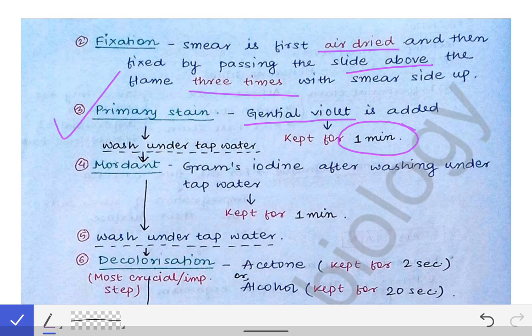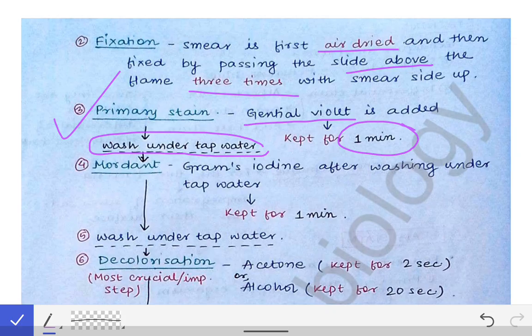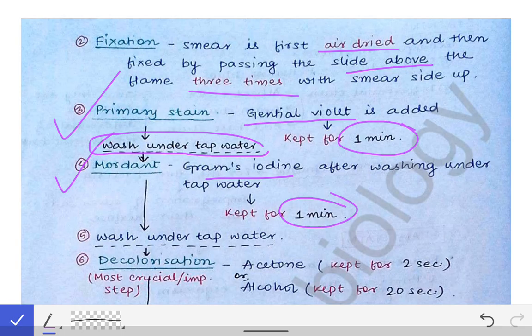Intermittent washing at each step is very important. After waiting one minute with the primary stain, we wash the slide under tap water. Then we add the mordant — Gram's iodine — and also keep it for one minute over the slide.